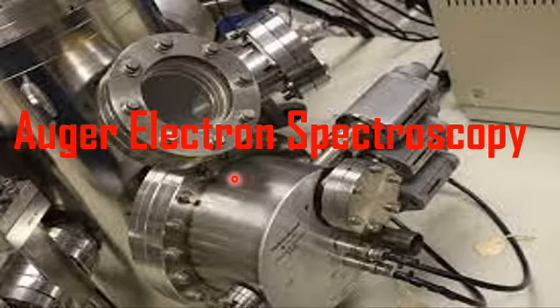This means that Auger electron spectroscopy is a technique which tells us about the composition and elements present on the surface of a material.